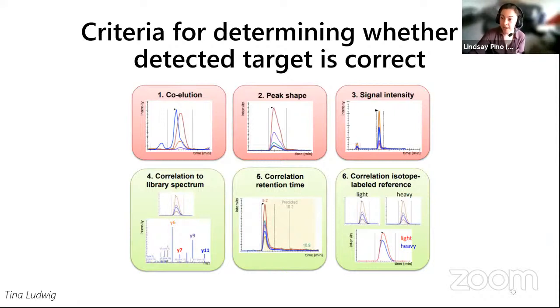We got the no enzyme question. So if you're not using a digestion enzyme, sorry, if you're doing something like immunopeptidomics or venomomics, you can add a no enzyme. You could also just skip that whole step and type your targets directly into the document. So just right on the left-hand side, you can add targets simply by typing on your keyboard whatever peptide sequence you want to look for in a targeted setting.